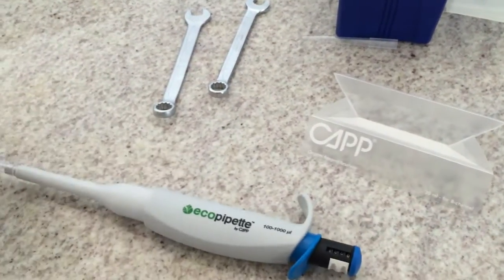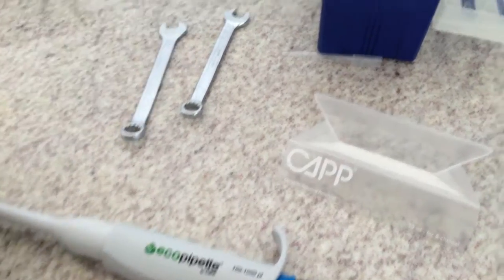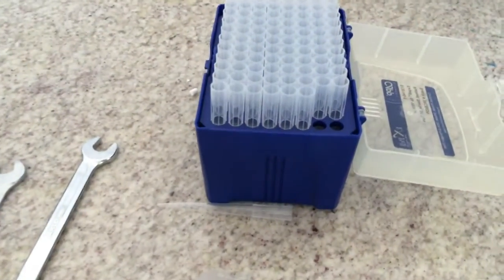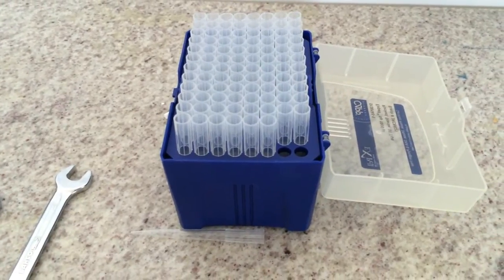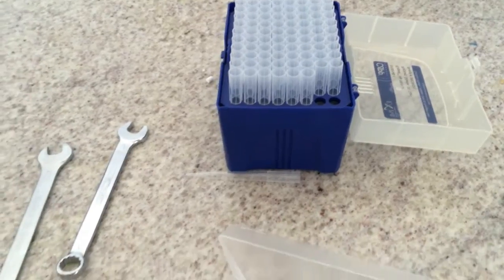If the pipette is leaking or not aspirating any liquid, you must be sure that the problem is on the pipette and not in the pipette tip being used. Test it with Kappa Expel tips. If the problem continues, you may conclude that one of the sealing areas might be worn.